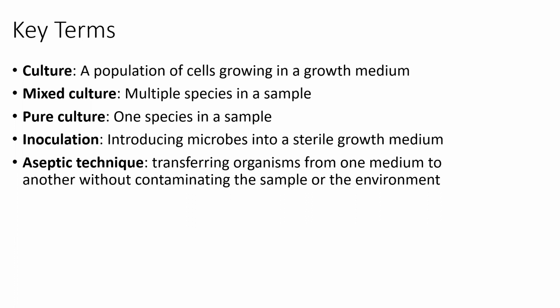So when you are inoculating, you want to make sure that you don't contaminate yourself, your workspace, anybody else, right? Or the new sterile media, right? Nobody wants contamination. And so the process of transferring organisms without contaminating anything is called aseptic technique or aseptic transfer.